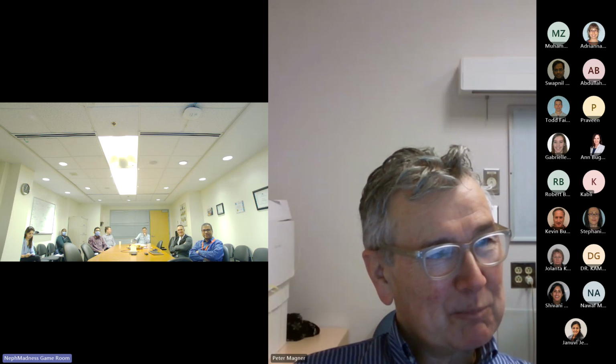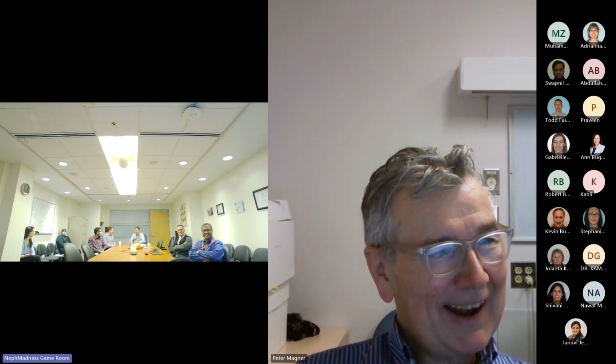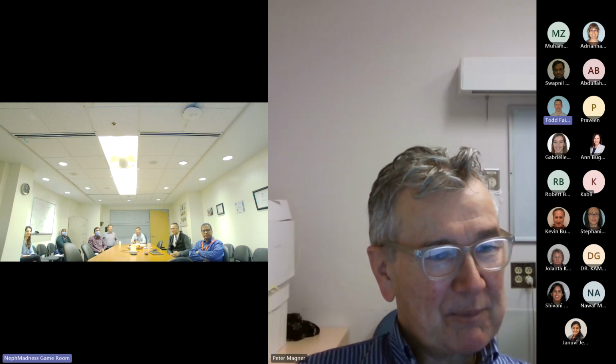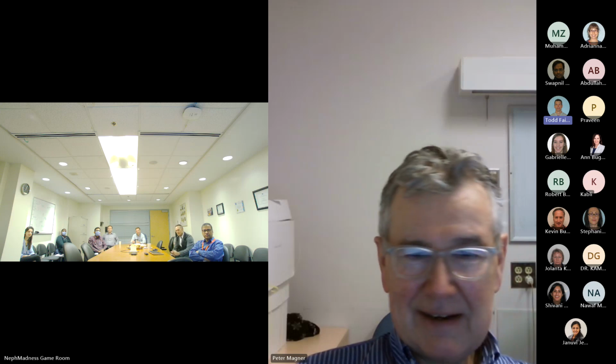Todd, maybe you know something more. Mike Harris can prepare this. Yes, exactly. Mike Harris loves microscopy. He definitely knows how to use the microscope, as do I. And we definitely have phase contrast and bright field on it. We don't have stains, but it is an excellent microscope, and I'm happy to give people a tour when you're in the pit, or we can do a formal tour.